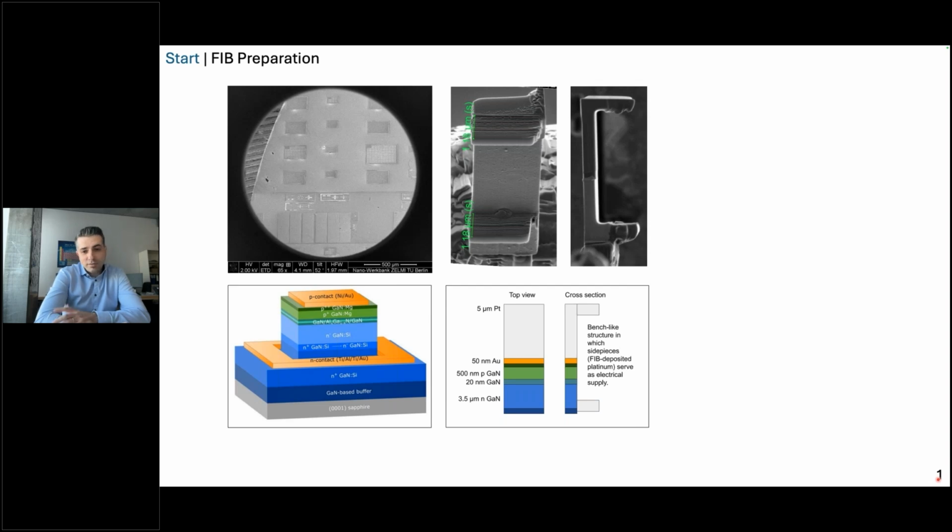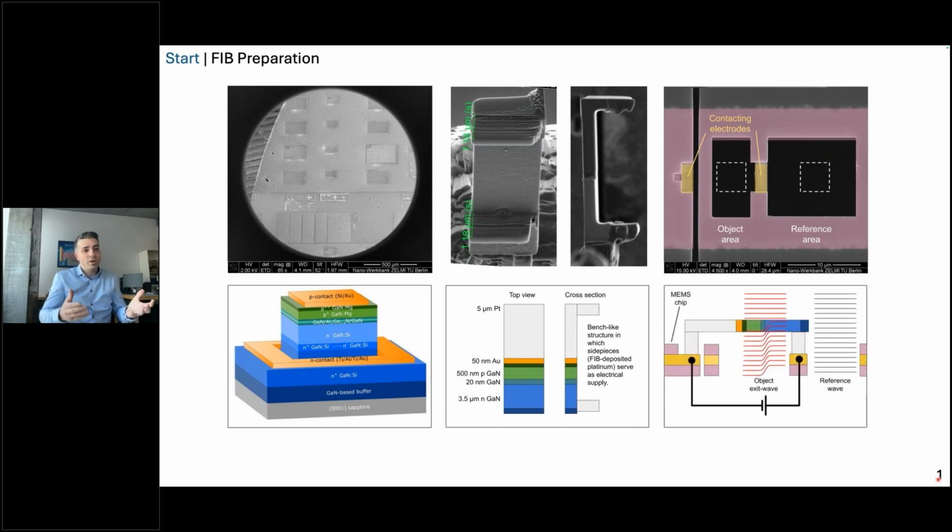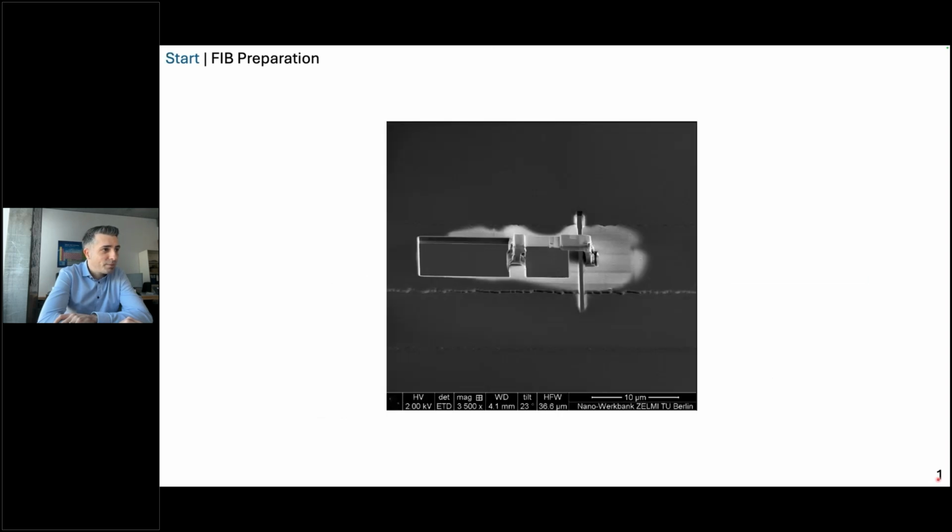and then, for putting it onto the contacts, it was also necessary to modify the MEMS chip so that we had the right geometry to do our experiments. And back in the day, this process seemed reasonable to me and also to Dirk Berger, because it was the only option for us. And please keep in mind, this preparation process took about 2 days. So we needed 2 full days to prepare one specimen to come up with something like this.